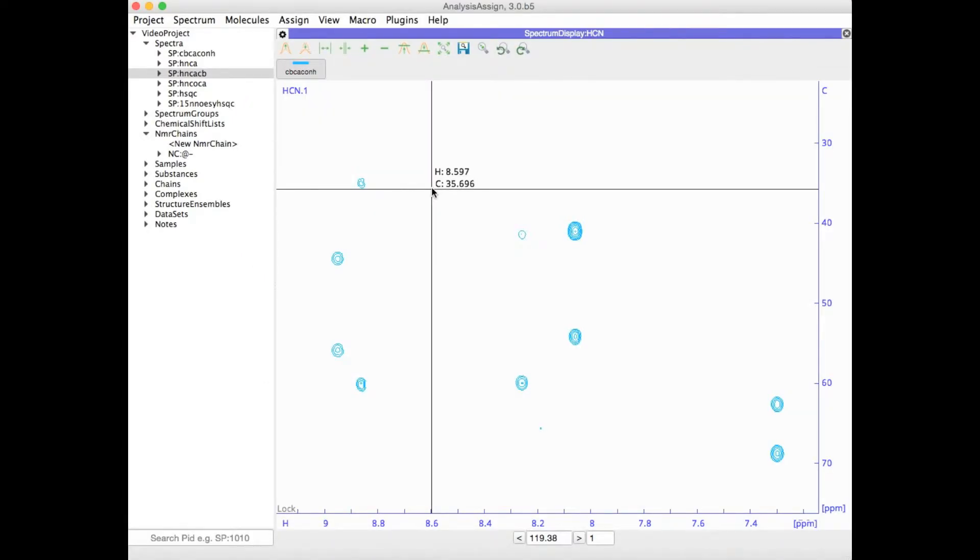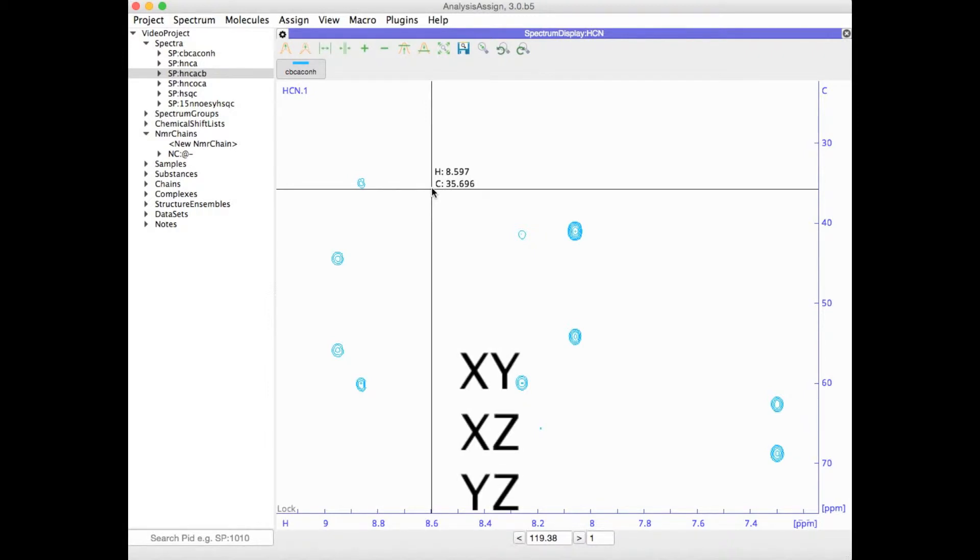It's very easy to flip the axis arrangement of 2D and 3D spectra in Analysis version 3. All you need to do is type XY, XZ, or YZ to flip the axes in question.